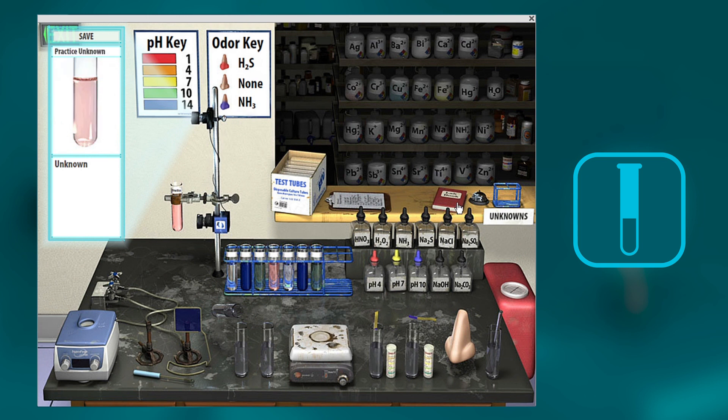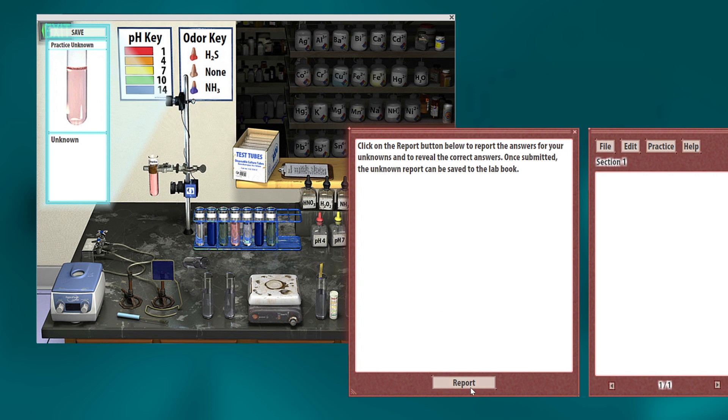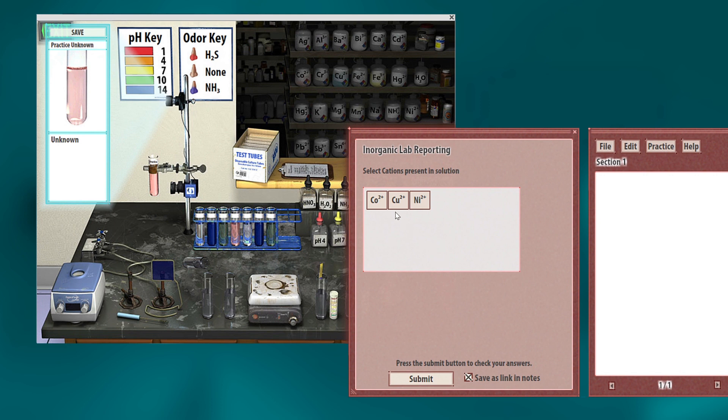So then what I do is I go into the lab book here. And based on what I have determined that I have in that unknown test tube, I think I have actually all three. I didn't expect to, but I do.